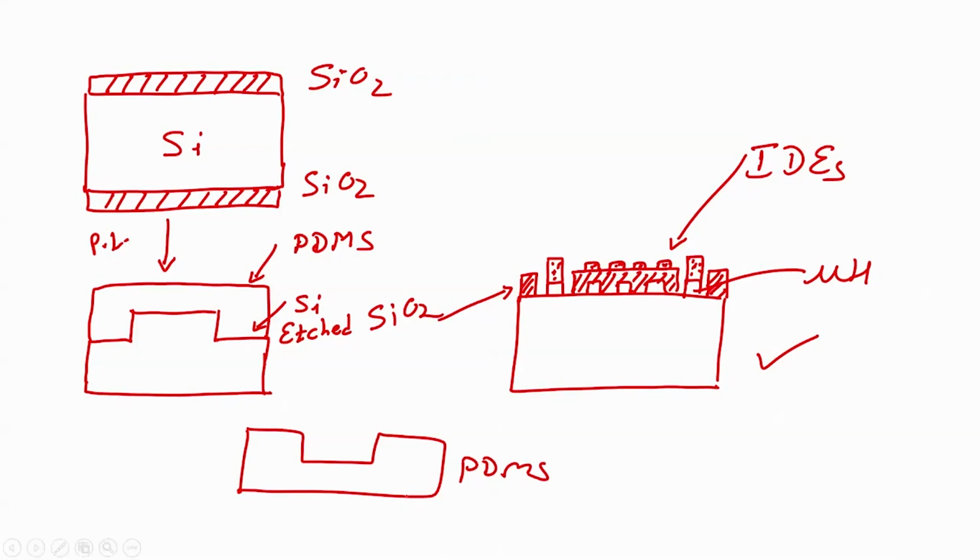This PDMS I will take and I will just load it right over here.